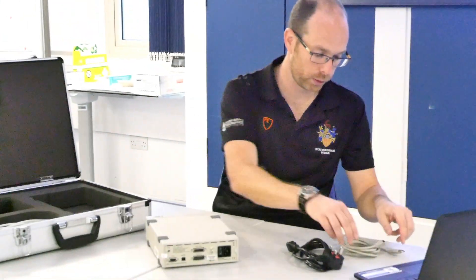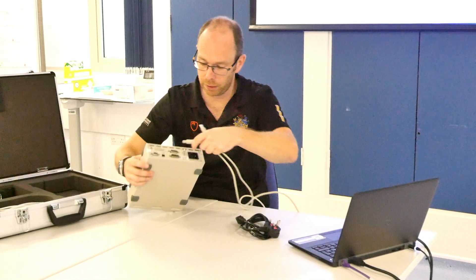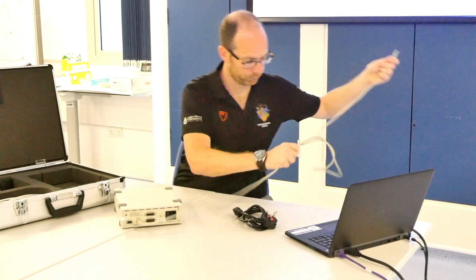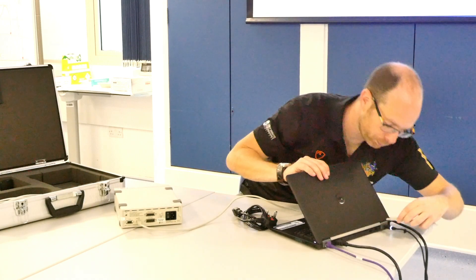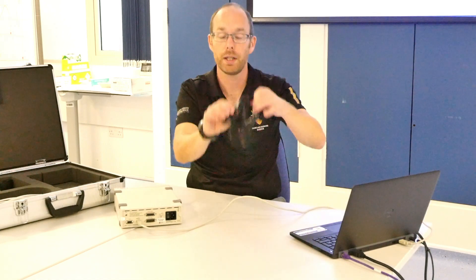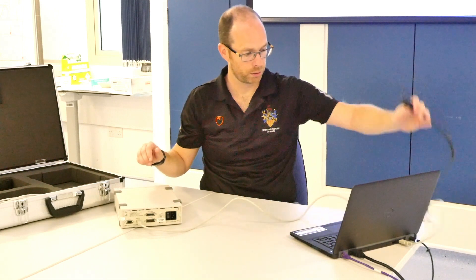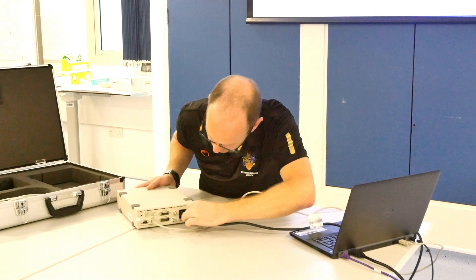So when we start connecting everything, get the USB and plug that into the computer. Then take the power cable and plug that in at the back as well.